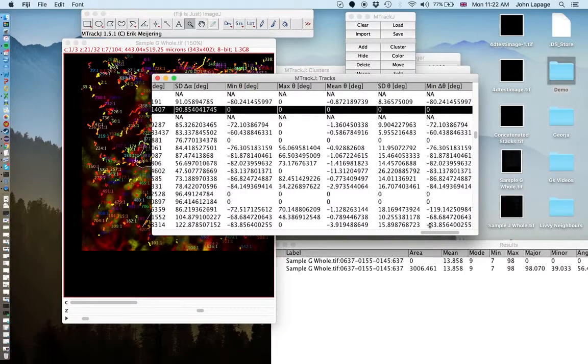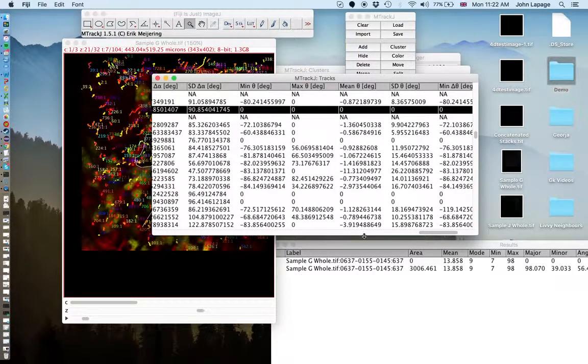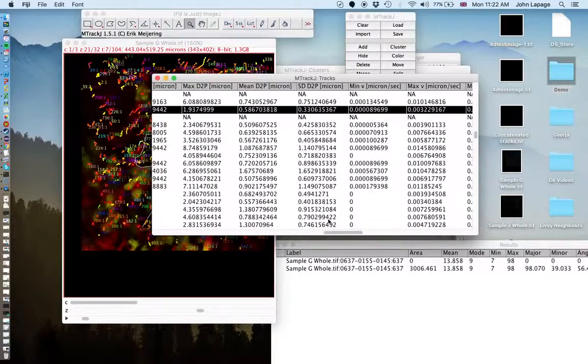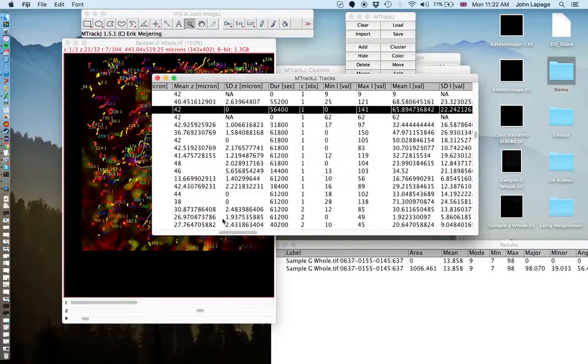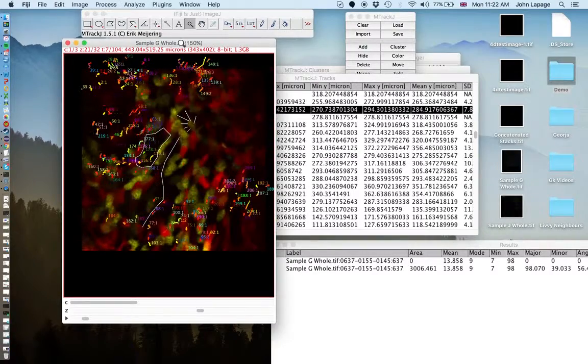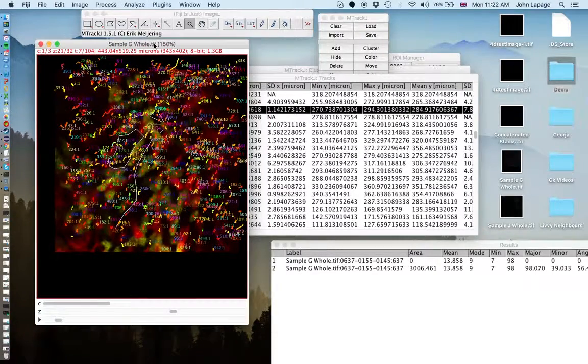It'll also tell you things like theta, which is the maximum amount of degrees it turns through in the z dimension. So that tells you if it goes up or down, which is kind of handy. Yeah, and that should be sufficient to let you document what you want about the shapes and dimensions of your lumen.